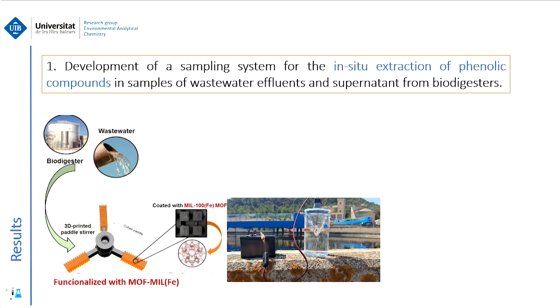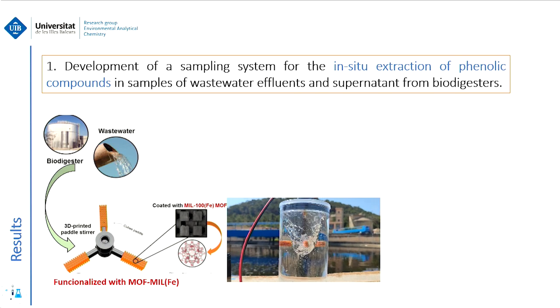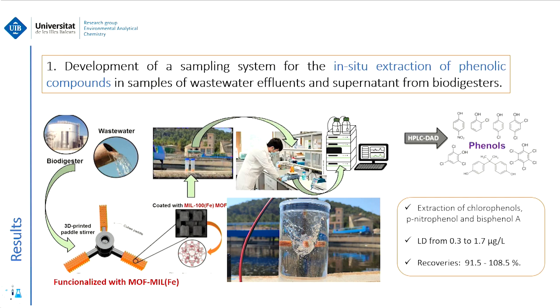We can take the device and put it in the station. Like that, we don't need to take 2 liters or 5 liters of sample to the laboratory; we just take the device and put it in the treatment plant. Then we take it to the laboratory to make the extraction and then the analysis by HPLC, for example.